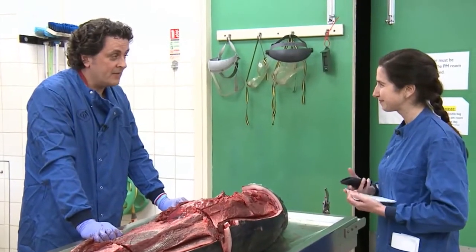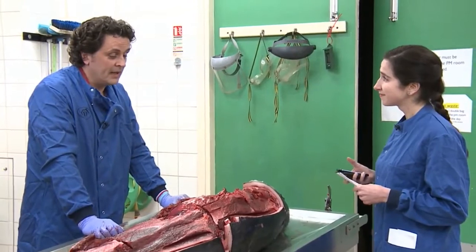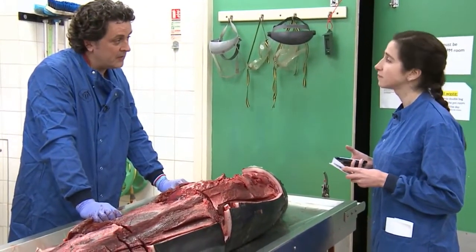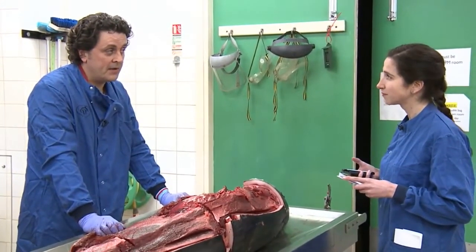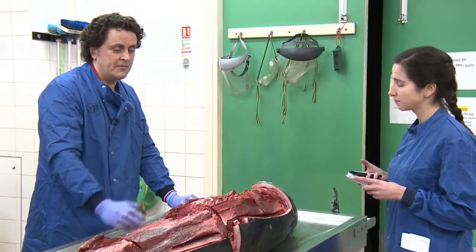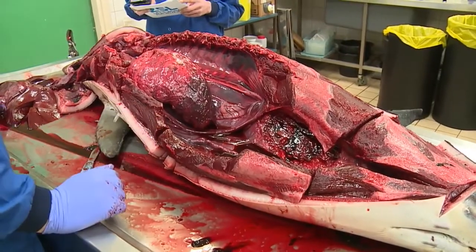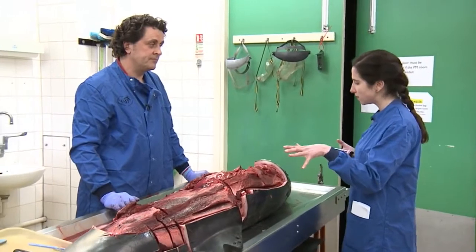I guess I have to say, unfortunately for the dolphin, it is as expected. So we're building up that picture of an animal that appears to be in good health, that's died suddenly, has evidence of gear entanglement around the outside, and I think we're probably going to see something in the stomachs too. So we have trauma, net marks, recent death, feeding. That's our criteria.